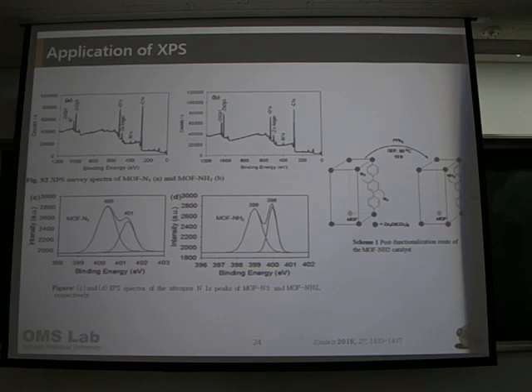쟤는 지금 2개씩밖에 안 해놨는데 전후에 픽에 그냥 겹쳐 있을 거 아니야? 겹쳐 있어도 해야 돼요. 아 그걸 어떻게 해? 그건 기계가 알아서 나오죠. 합쳤을 때 저 그래프의 모양이 나오는 거였으니까. 커다란 서페이스에 있는 그래프는 디바이딩 된 애들이 다 에디션 돼서 나오는 그래프여서, 포지션을 딱 잡아주면, 예를 들어 지금 저게 400이랑 399.5 정도라고 생각하면 그 포지션을 잡고 여기 위치에서 디바이딩을 하라고 하면 399.5는 이만큼만 올라가고 얘가 대부분을 차지하는 그래프가 알아서 그려질 거예요.